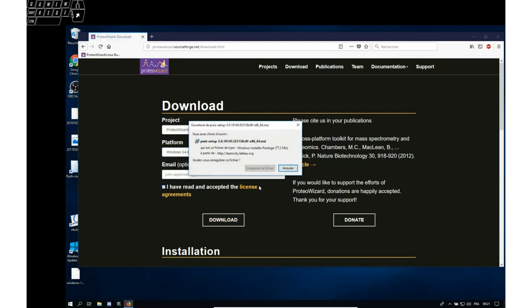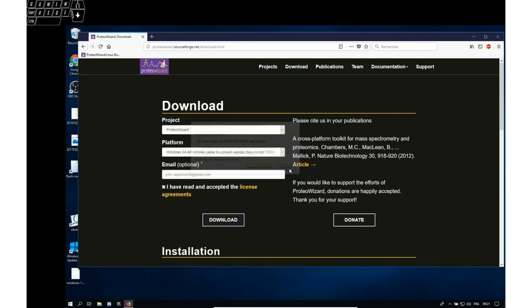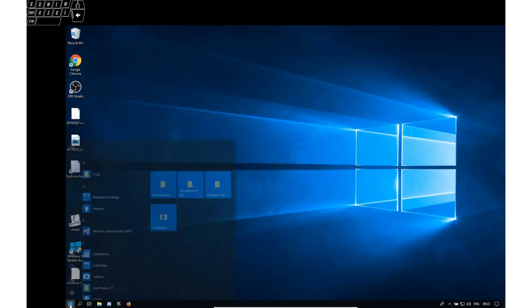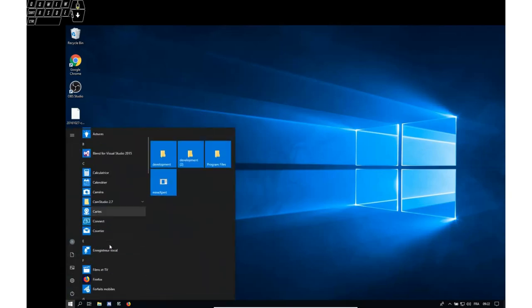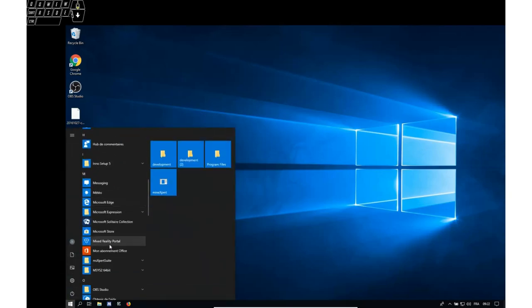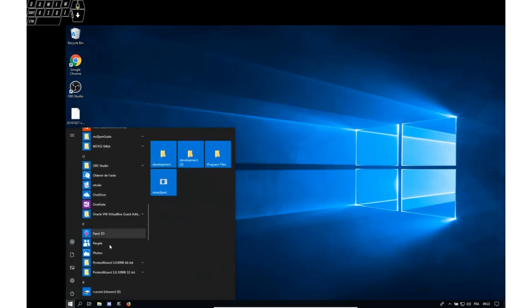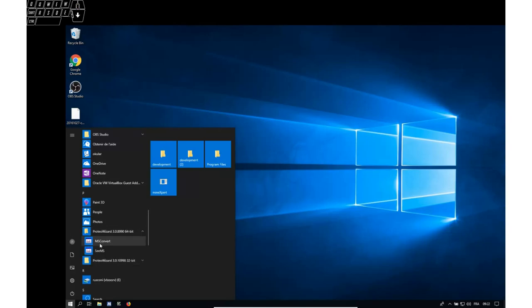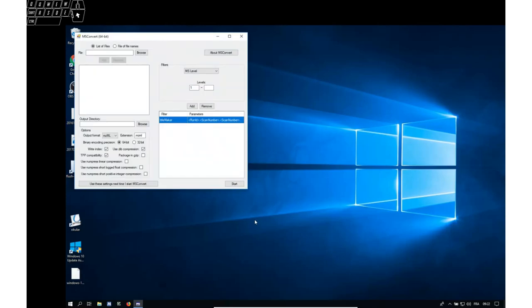This download I already did so I'm not doing here right now. Once you have installed the ProtoWizard software it should appear in the menu here. If you go to P, scroll down, 64-bit, and you run the MSConvert software.